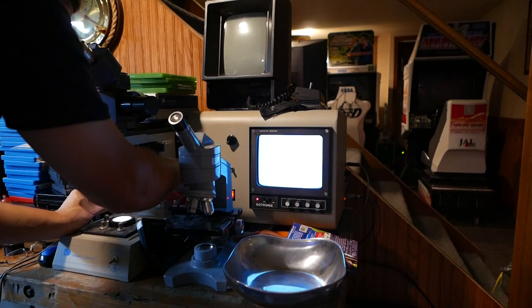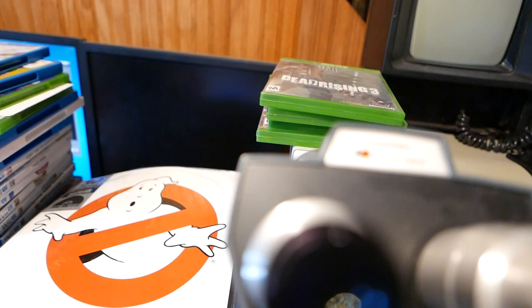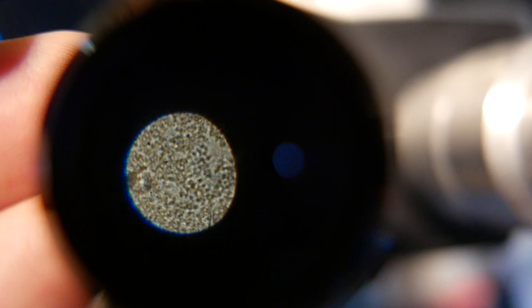Why don't you give me the camera for a second? I just got it to one of the perfect spots to see it. Well, let's see what happens if I do this. They can see it on there. Well, you can't — it's just a bunch of black blobs. Let me see. Lots of black blobs. There's definitely something in there. There we go. Those little specks are the bacteria.